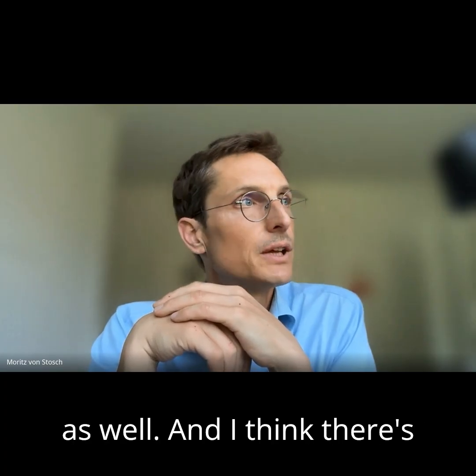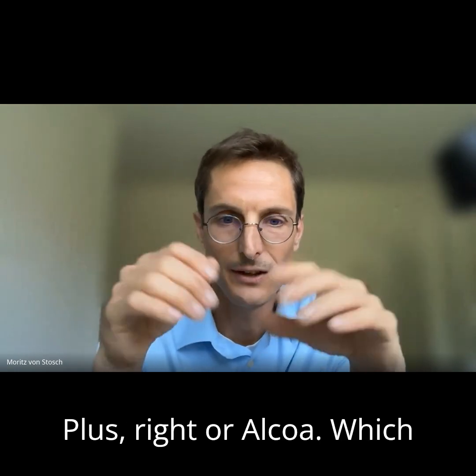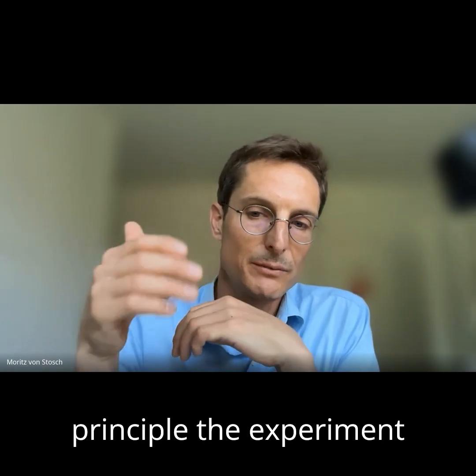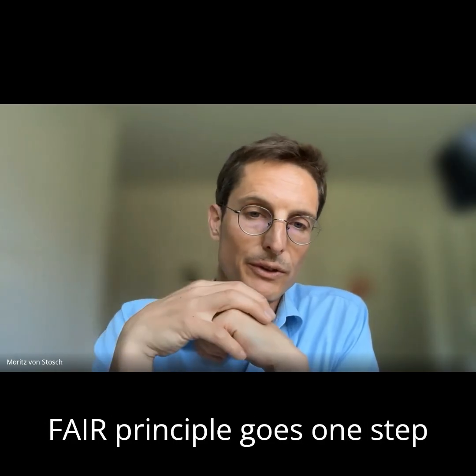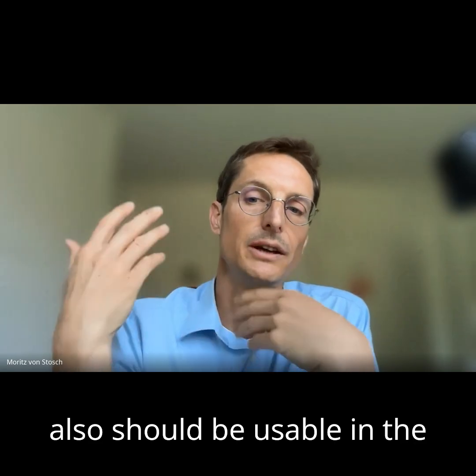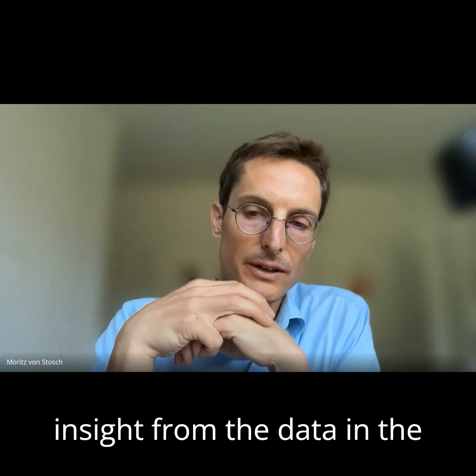And I think there's this FAIR data principle. So there's of course ALCOA Plus, right, or ALCOA, which is coming from the regulatory body, making sure that the data is captured and done in such a way that in principle the experiment could be reproduced. But the FAIR principle goes one step further, in that the data should not only allow to reproduce the process, but also should be usable in the future, and you could essentially gain additional insight from the data in the future.